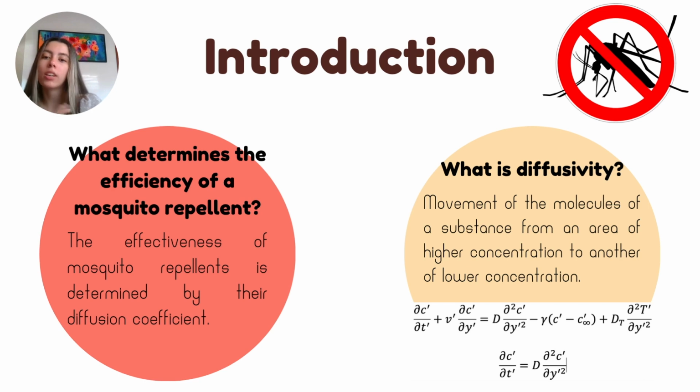This parameter can be considered one of the crucial physical properties of repellents that can affect their effectiveness against mosquito bites and can be an indicator of the release rate of the repellents. This depends on the vapor pressure at room temperature and is associated with the boiling points of the repellents. To evaluate this diffusion coefficient of the repellents, we are going to use spectrometry analysis with UV-Vis.